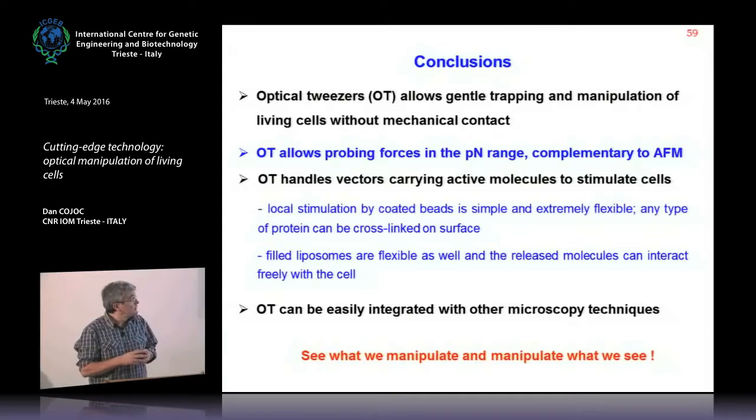From the technical point of view, it is also important that optical tweezers can be easily integrated with other microscopy techniques. So we have a platform where we can insert more. In conclusion, it is good that we manipulate what we see, and we see what we manipulate.